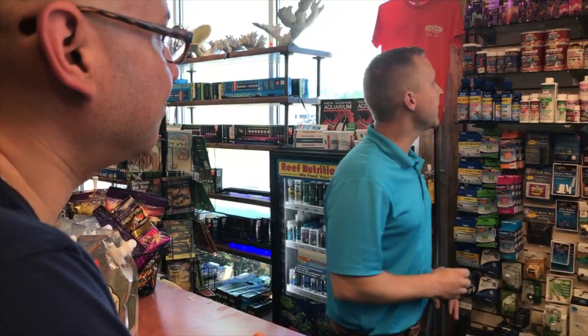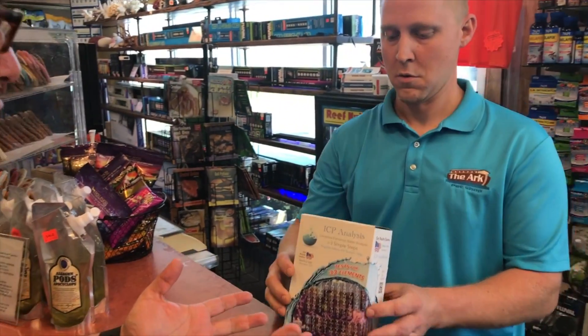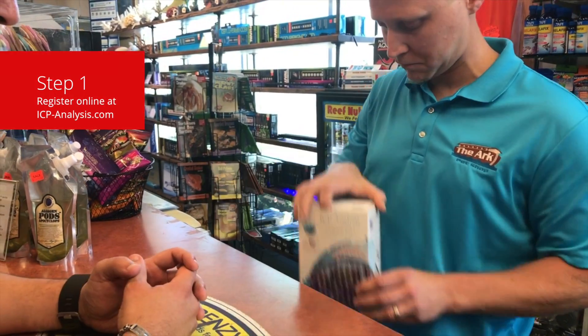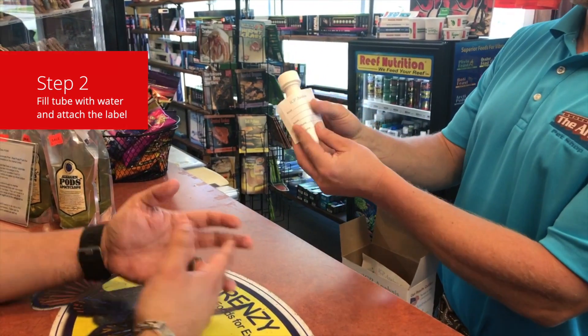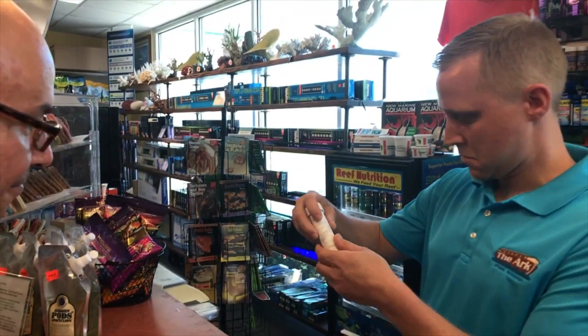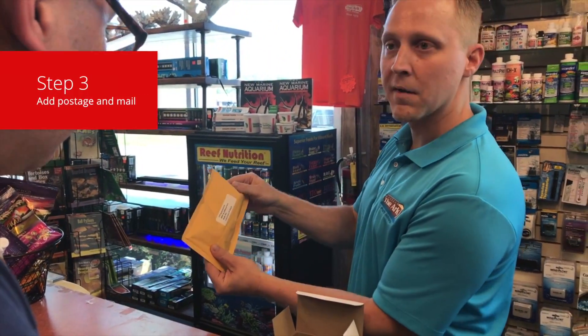Hey Paul, how are you? So I'm here about that ICP analysis test kit you mentioned over the phone. He explains there are three simple steps: first, register online; next, fill the tube with your water sample and attach the label; and last, stick it in the shipping envelope, attach the stamp, and mail it off. That's easy enough.